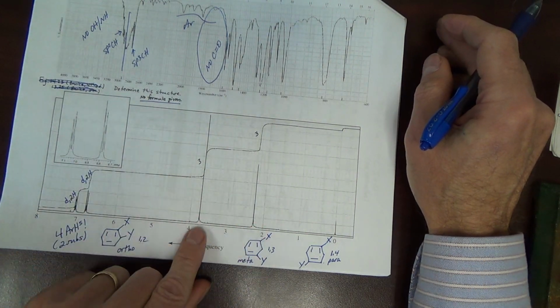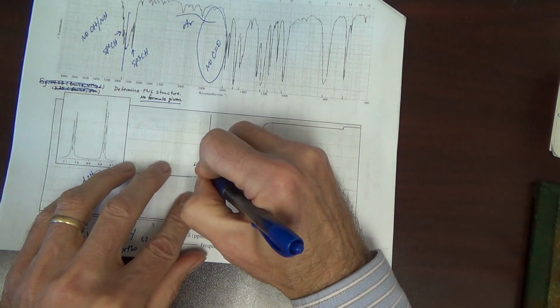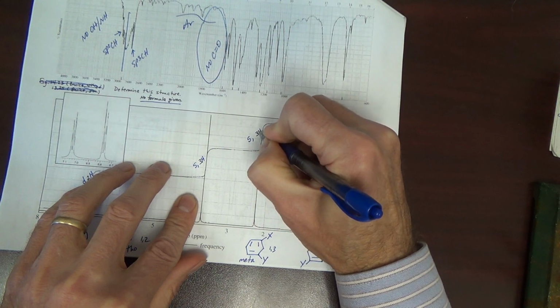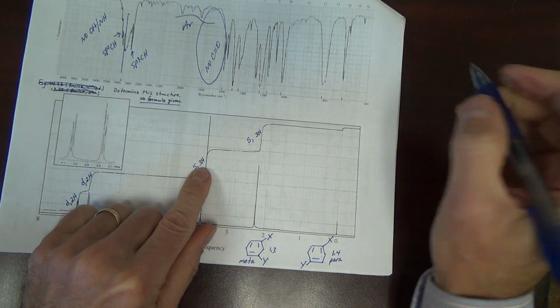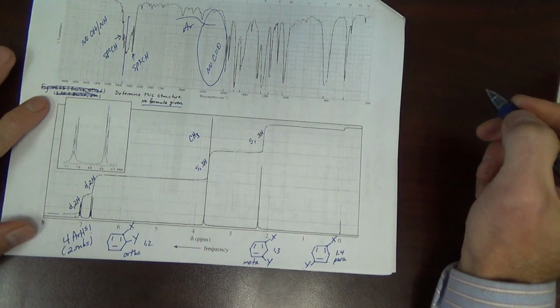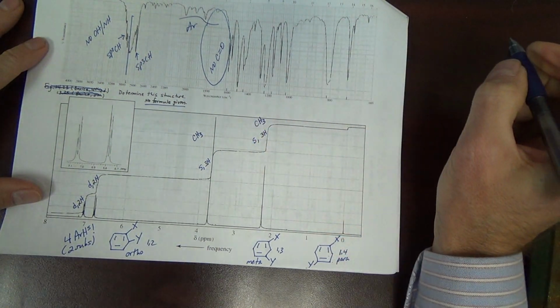Okay, let's look at these two signals. They're both singlets. Three H's. Most likely it's a CH3. Most likely this is a CH3.